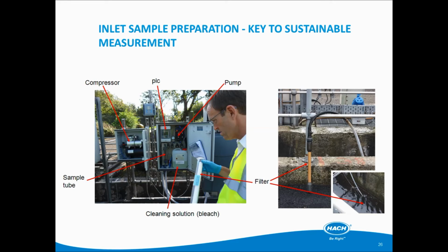This slide shows the components of the filter and the filter probe in use. The size of the filter itself lends it to use in final effluent where water level is low during low flow conditions. In this case, the filter can lay flat in an outfall channel.